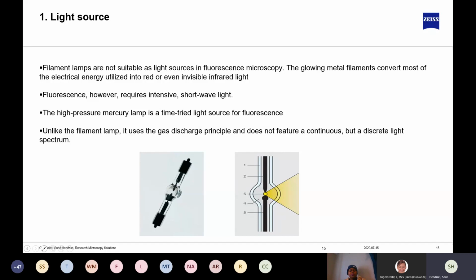So the typical recommendation is that you swap the lamps between 200 and 300 hours. You will always see that there is typically some sort of record book where you have to fill in how many hours you've used the mercury lamp for. This is so that you can track the usage of the lamp. Even though it can still give off light, we do recommend that you change it between 200 and 300 hours, which makes mercury lamps quite costly because you have to change them so often. They also have to be disposed of in a very specific manner.